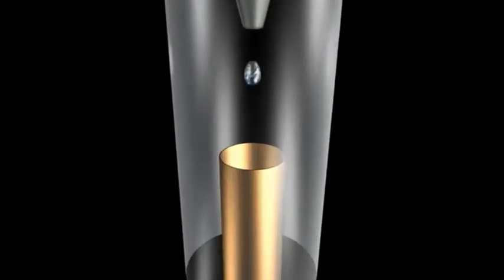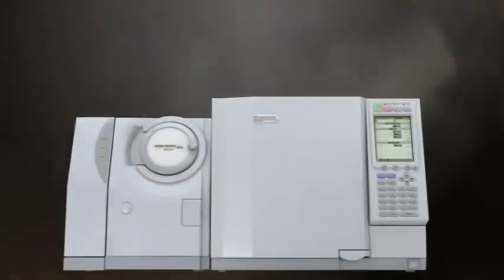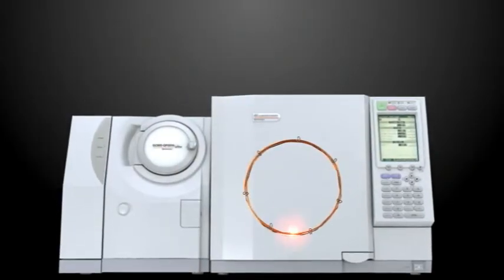High-speed temperature-programmed fast GC-MS technologies have been incorporated with the goal of increasing productivity in your laboratory.